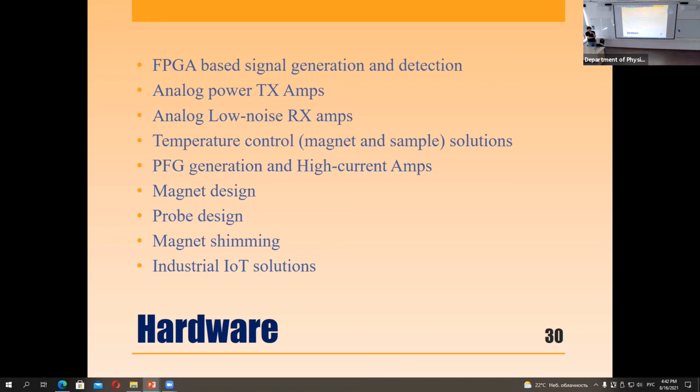If you want to work with liquids, because liquids don't require short pulses, in the high resolution system that we built together with the Israeli people, we used 8 watts. The 90 pulse was 100 microseconds. It was 8 watts on the 10 millimeter tube. On a 5 millimeter tube, you can use even 4 watts. You will get a kind of reply.